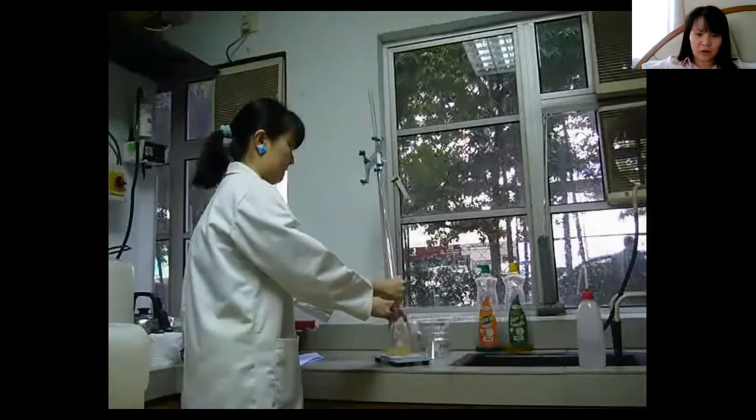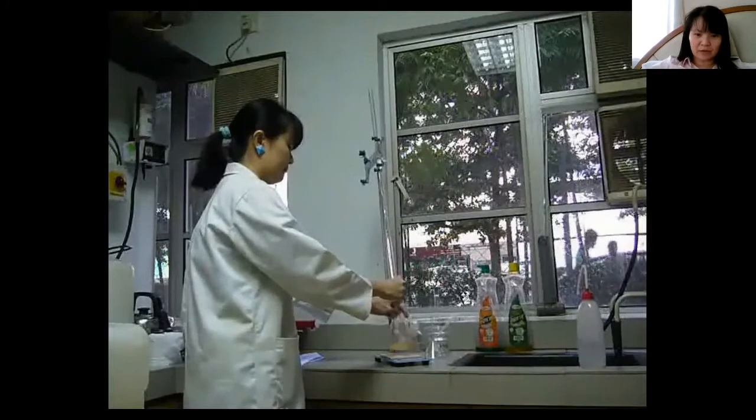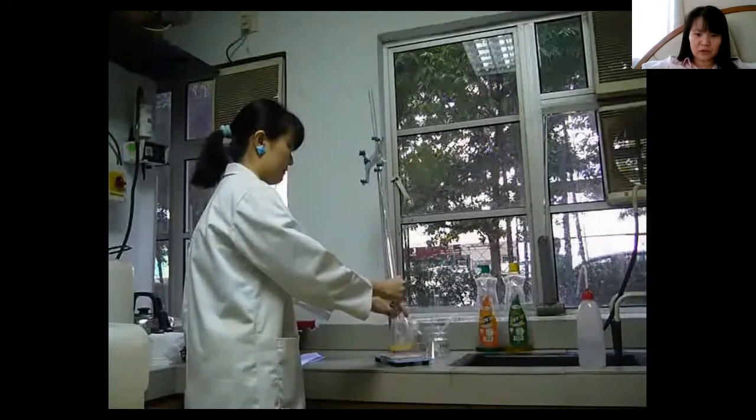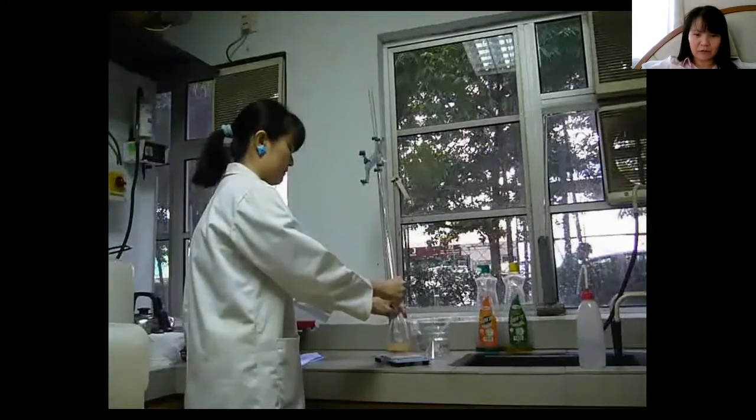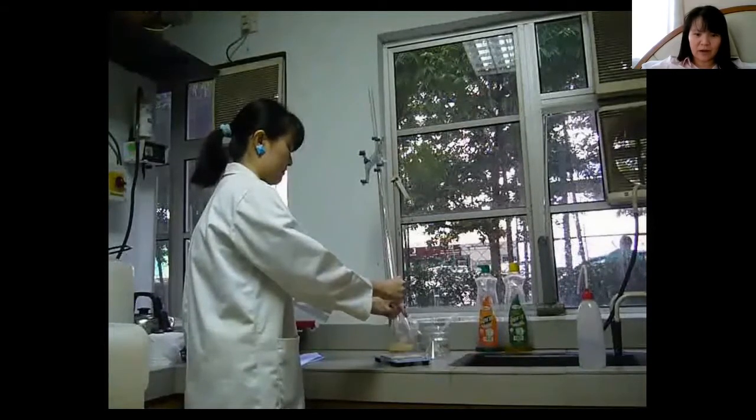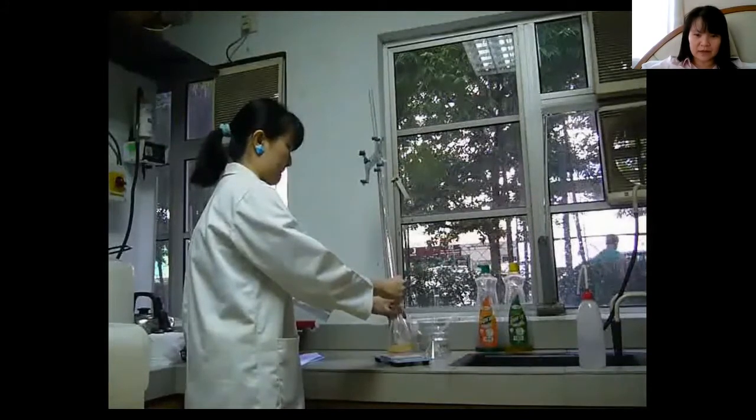At the endpoint, it should be orange color since this is methyl orange. And then we'll read the reading on the burette. If you overshoot, then it will become red. So methyl orange in acid will be red. It looks kind of pink because it's quite dilute.